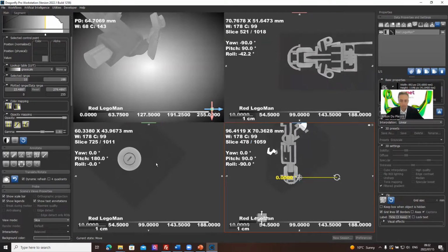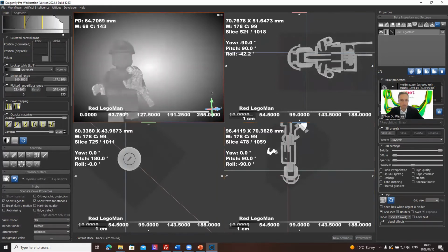And I think that's it, actually. So if we turn this guy upright, you see z-axis is now upright. So that's how you orientate your data along X, Y, and Z axis in a simple way.